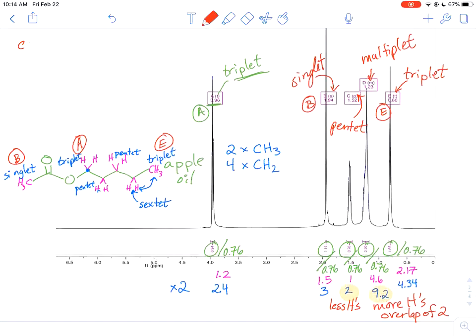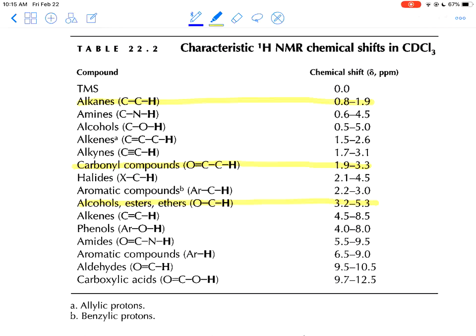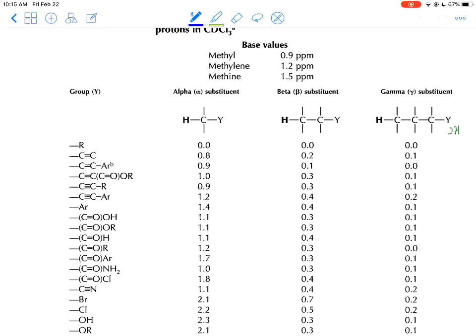So this is going to be a good opportunity for you to practice your calculated chemical shifts. So you're going to calculate the chemical shifts for each of these protons. And now, since we've already used the ABCDE, I'm going to call these like one, two, and three. And what I'd like for you to do on your own is to calculate the chemical shifts for each one of these using the correlation tables. This is the beginning of those tables. We've already assigned these protons. You can just put those ranges in for the ones that are applicable. And now we're going to be exploring three different sets of protons that are within 0.8 to 1.9, meaning we're going to need to go to the actual correlation table.